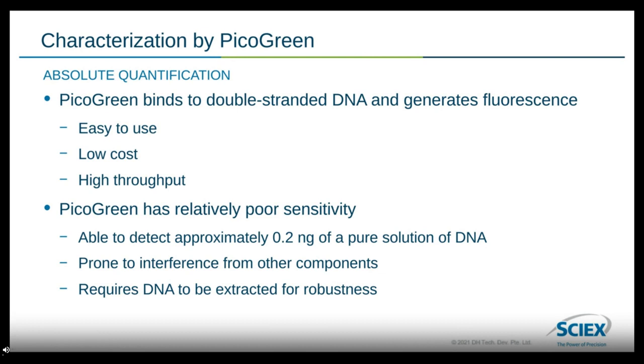But the lack of sensitivity might be its most major limitation, especially given the guidance from the WHO, where you really want to set your threshold at about 10 nanograms per dose. And therefore, we generally don't want to use this for final product release, especially when we're using high dose products.